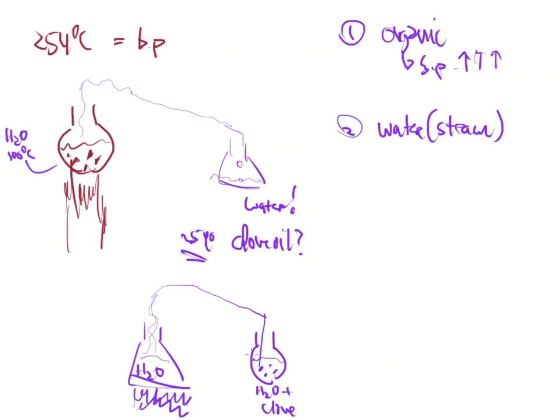So think about that for a minute. You're boiling spaghetti water on the stove, and you put your face over the water vapor that's leaving. It's going to be super hot, and you can scald yourself if you do that. The same concept is happening here. That is very hot steam that's coming off from that water container, and this steam is about 212. That's typically where this begins to start, and it can get even hotter.